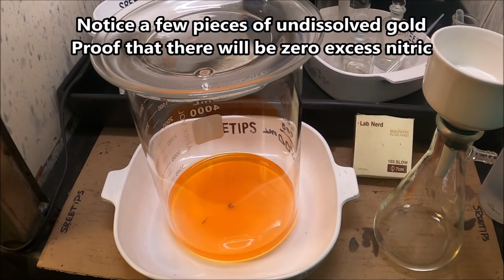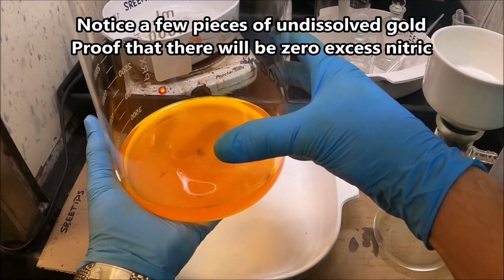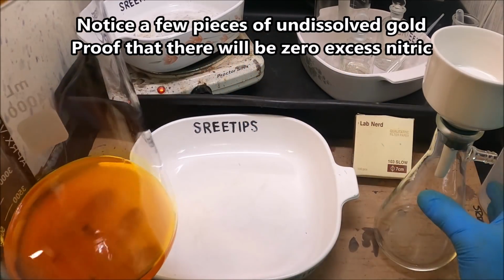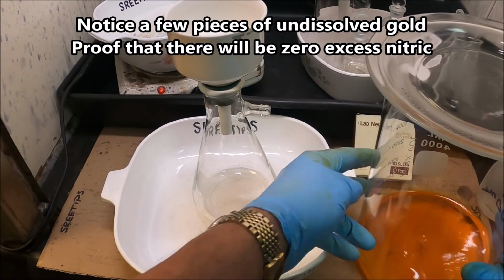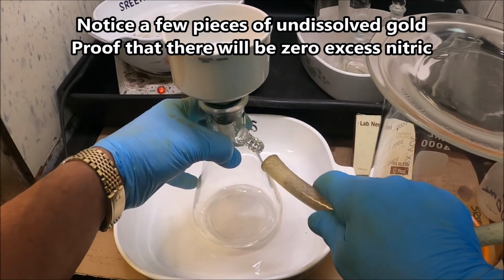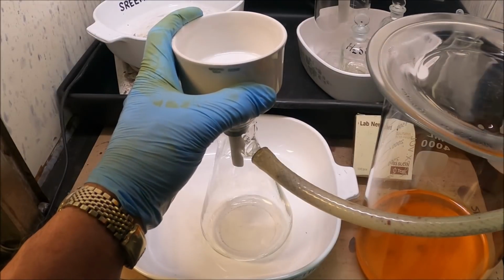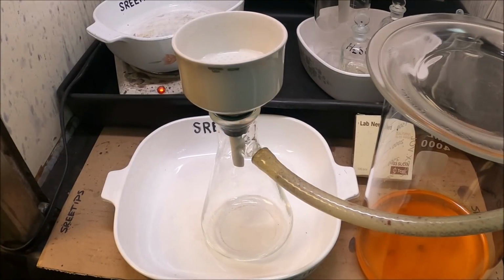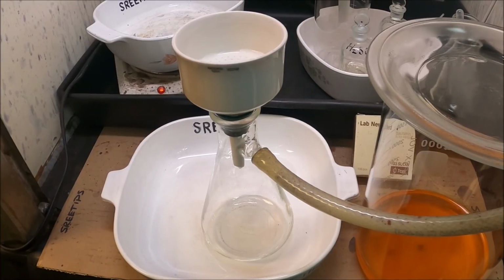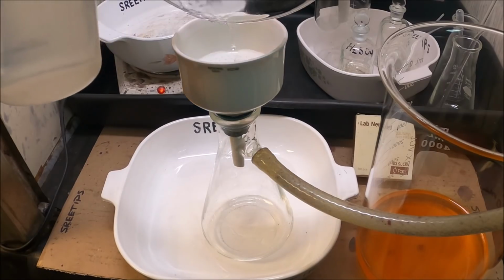I've allowed the solution to cool to room temperature. What we're going to do is filter it out now. Got a slow flow number 3 filter in this filter flask. And now we're going to filter our gold solution so we can precipitate it one more time.